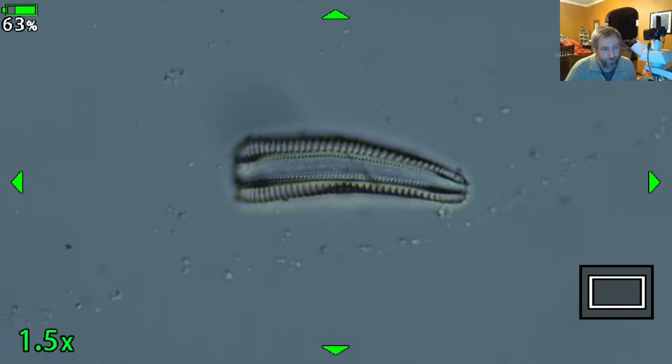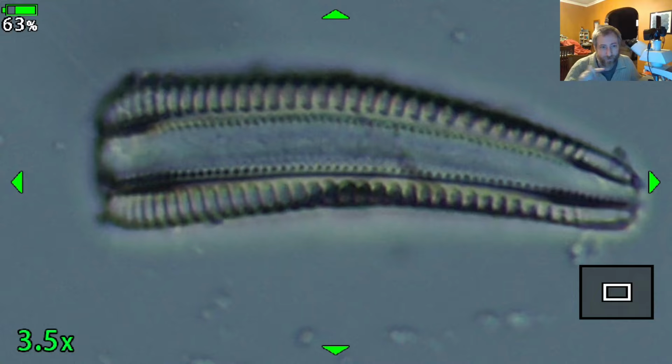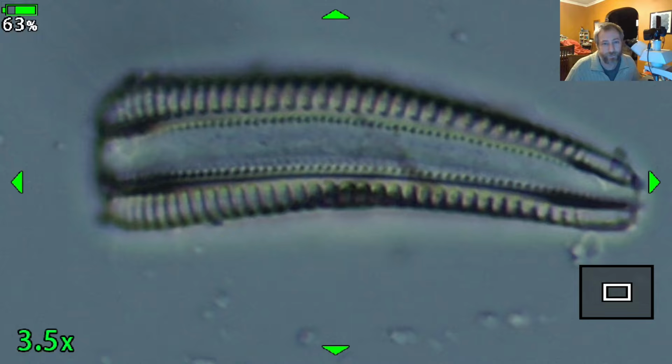Again, I can tell you immediately what the genus for this is. It's Rhoicosphenia, and I know that because there's not very many diatoms that have an arc shape like that that are also gomphonemoid. In other words, shaped like a fan. And also, if we were to look at this thing from the valve view, it also would be sort of shaped like a cone or something like that, like an ice cream cone almost, or a submarine.